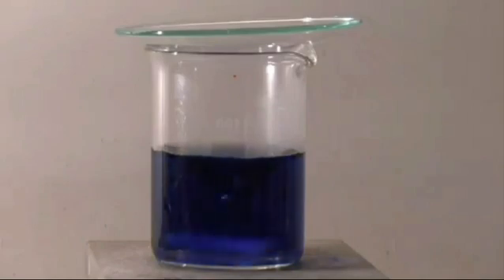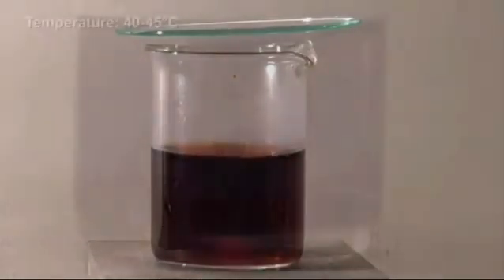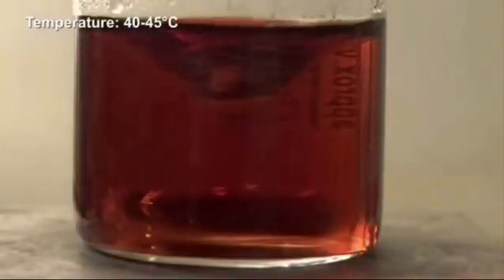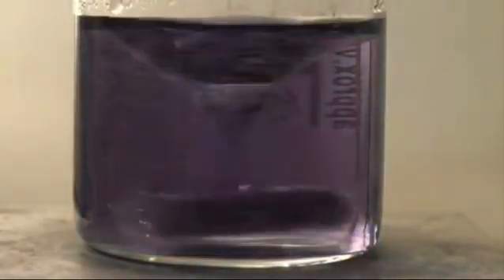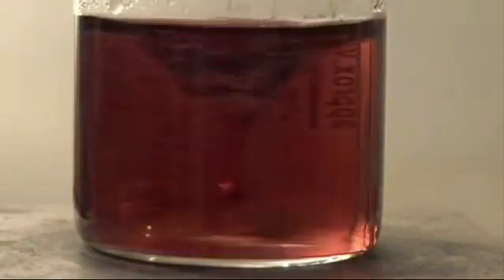The color has changed now. Now it has become different. This is the reason why it has been heated, to increase the speed of the reaction, at a temperature between 40 to 45 degrees Celsius to make the reaction fast.